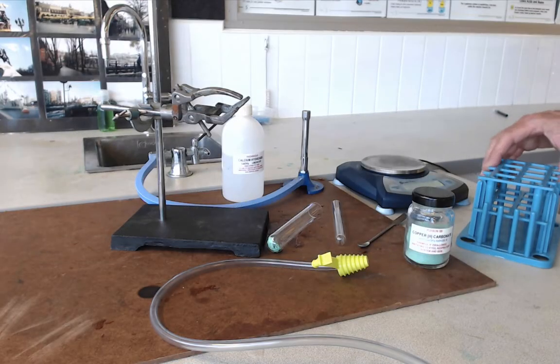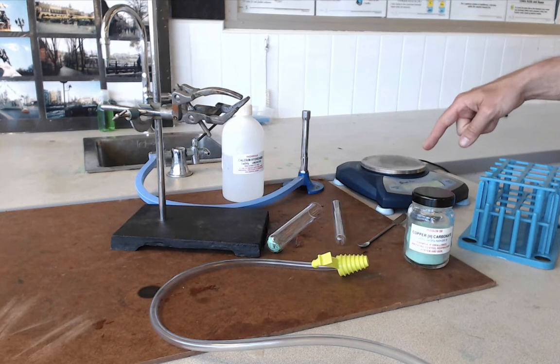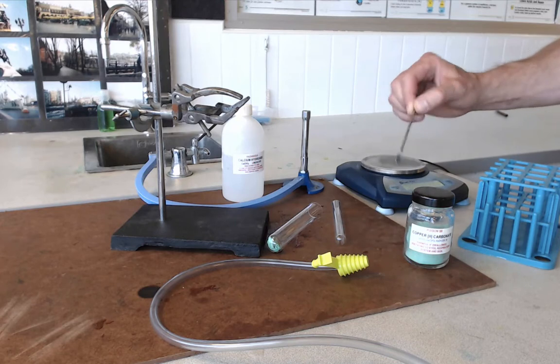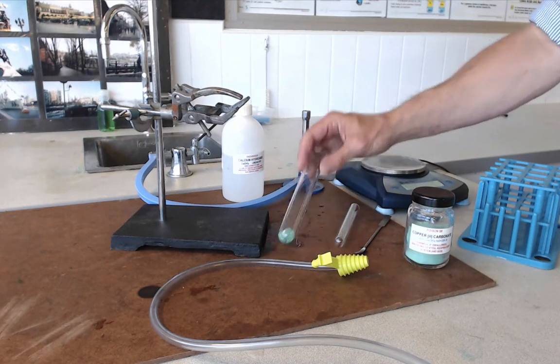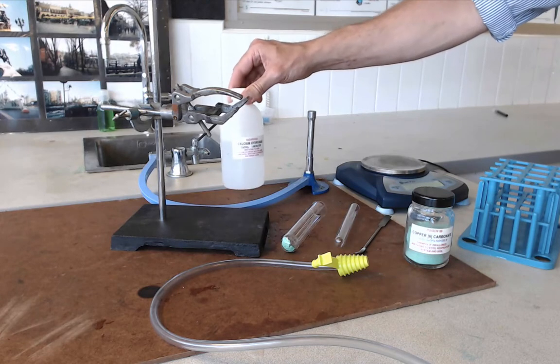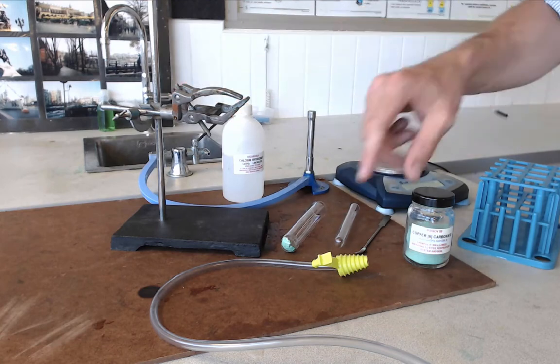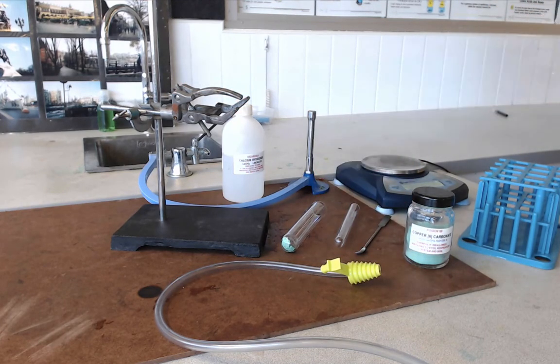For this practical you are going to need a test tube rack, some copper carbonate, a balance — so an electronic balance — a spatula for you to get your solid out of the jar, a test tube (that's the skinny tube), a boiling tube (that's the fatter tube), a Bunsen burner, some lime water or calcium hydroxide solution, a clamp stand, a heat mat, a Boston clamp, and a delivery tube to get you between two glass tubes.